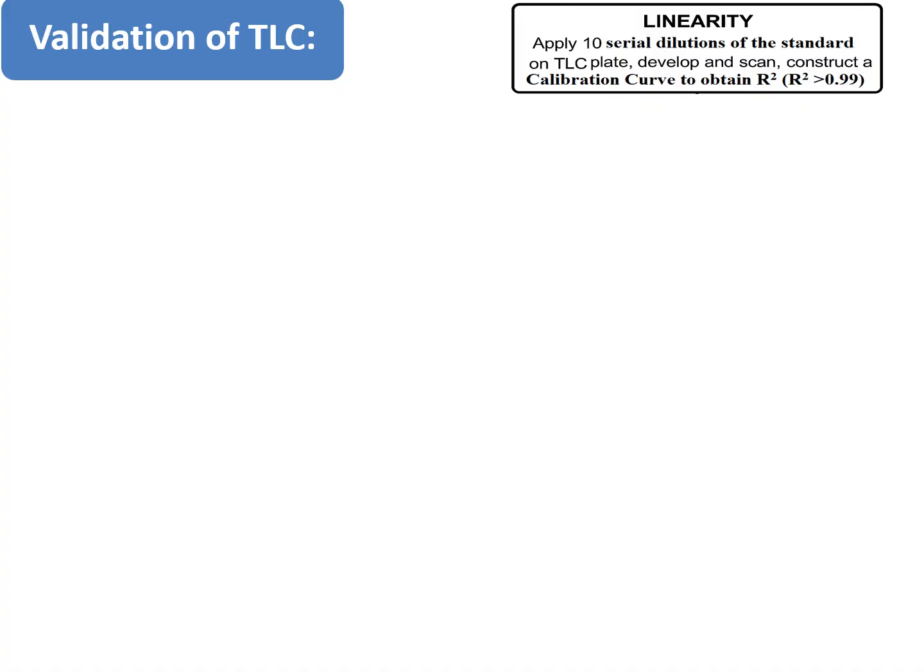Now, linearity refers to the ability of an analytical method to produce test results that are directly proportional to the concentration of analyte in the sample within a given range.